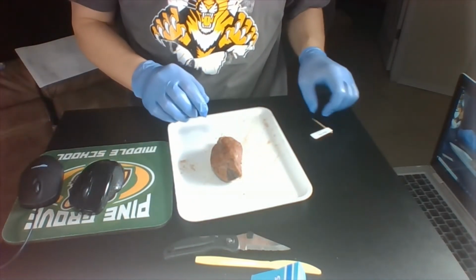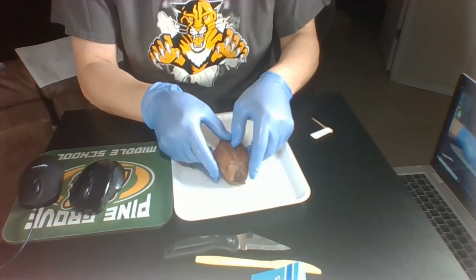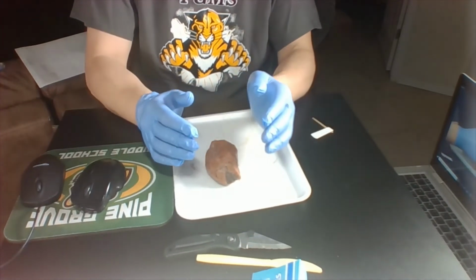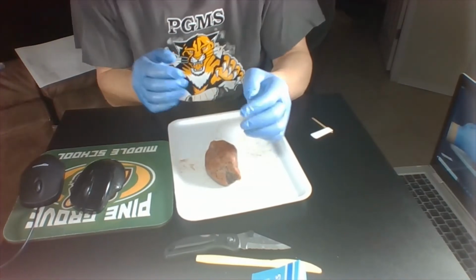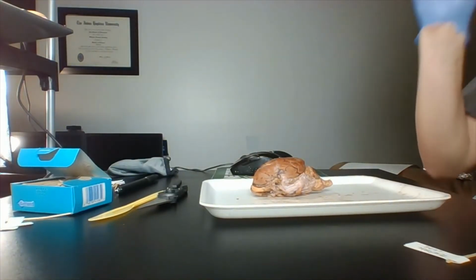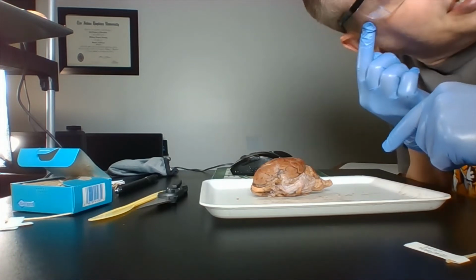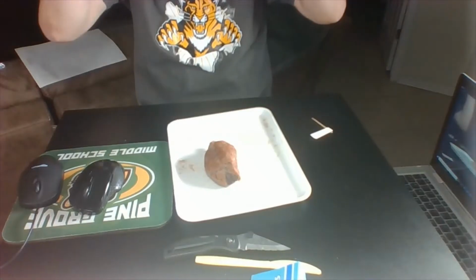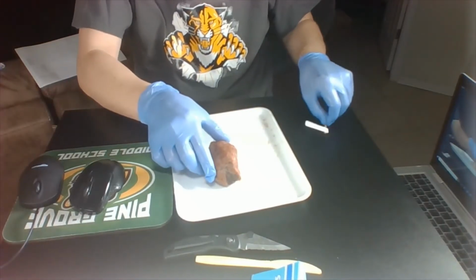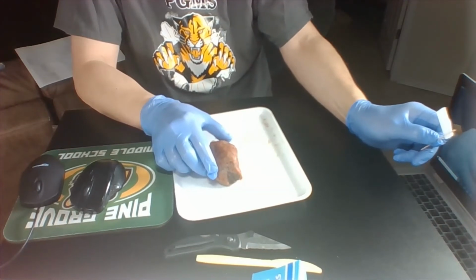Okay, the next part is just going to be a quick one. If you've heard of somebody talking about the temples on your head, like the side of your head, it's on... I don't know if I can show you. Hold on a second, if I can get my head in here. On the side of your eye is your temple right here, kind of in between your ear and your eye. So this is called a temporal lobe. If that helps, remember temporal lobe.